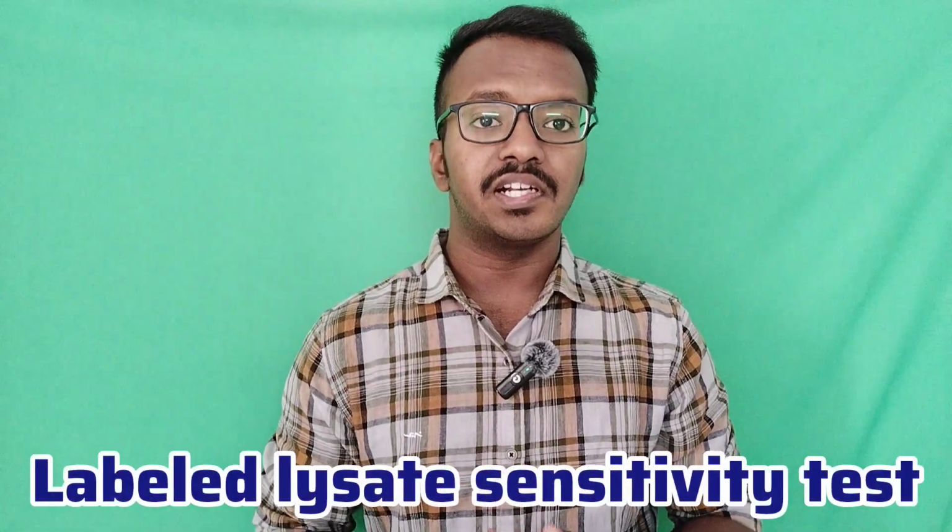Hello viewers, today we are going to discuss the labeled lysate sensitivity test. It is a common test performed between CSE and lysate. In this video, we are going to discuss how to prepare the standard curve, what is 2 lambda, and what is lambda.